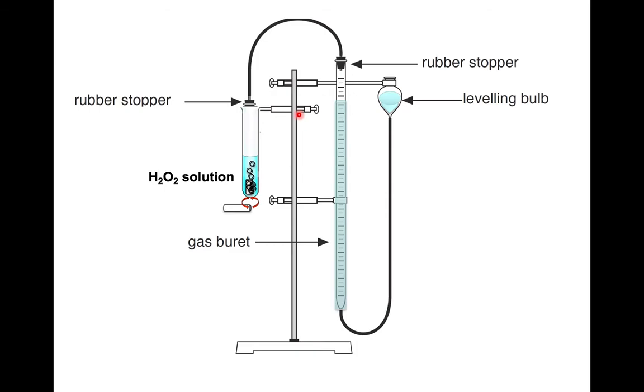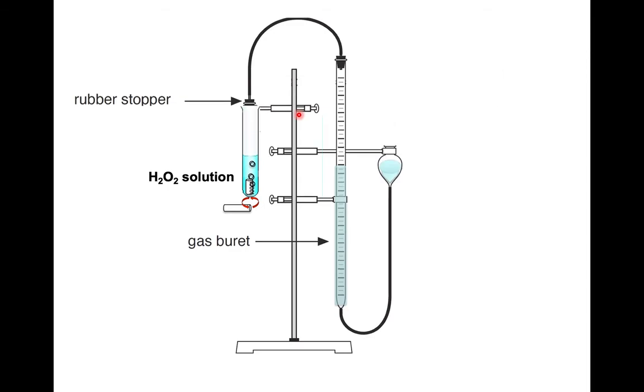And you can use the large stir bar in order to move the small stir bar around and cause the reaction to be stirred. So you'll rapidly see bubbles form, and pretty soon you will see the level of the burette drop. And you want to continuously lower the leveling bulb as you see this change. You don't have to do it every single mL, but as this starts to change, you want to keep these roughly in line with each other.